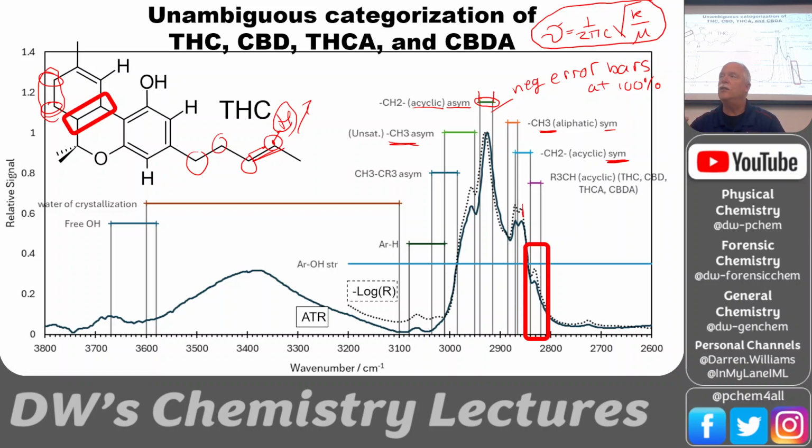It's in the region, so the double bond is changing the electron cloud around that CH bond. Yeah, you're right. It's not a double bond to the hydrogen, but it is changing it some, and we might see a shift to the CH2 stretch and the CH3 stretches and so on. Okay. Now look at some of the others.